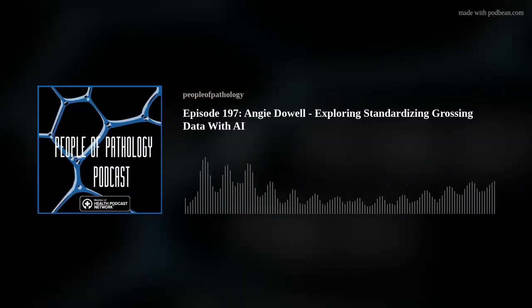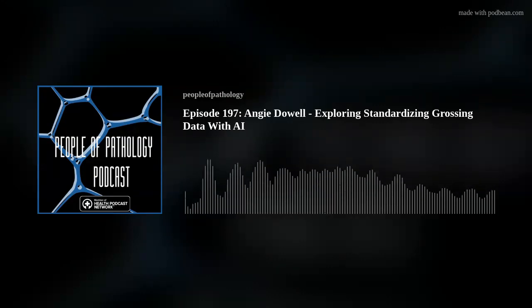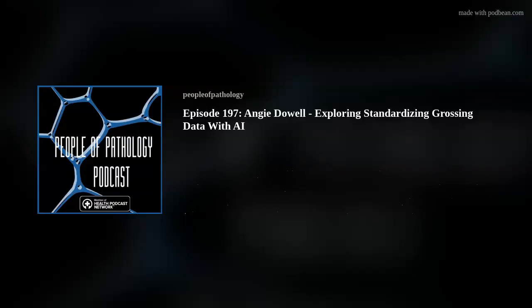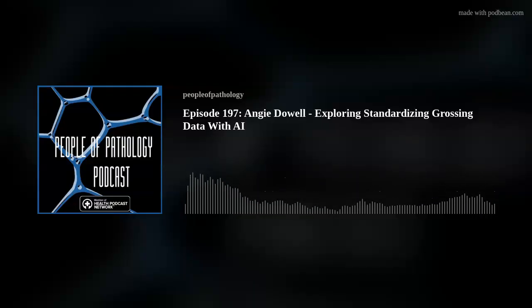So that's already making you more efficient because you've scanned your container, you've taken it out of the container, it's already measured and dictated and uploaded into Epic and Beaker. Then you can send it off to your cryostat. So if you're going through like an assembly line with 25 frozens, one right after the other, you're keeping it organized.